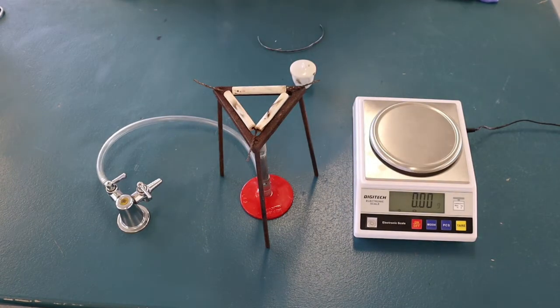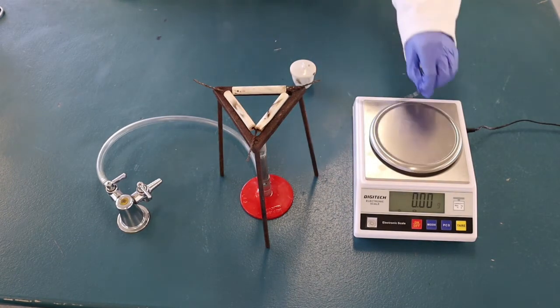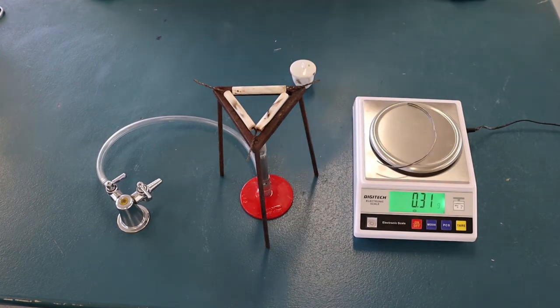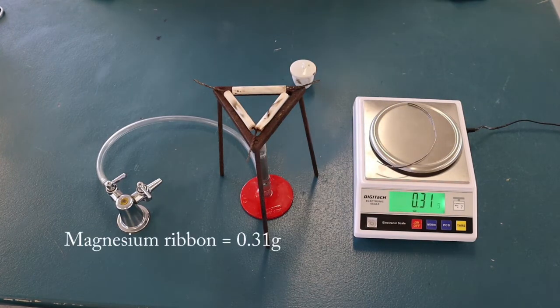Weigh the magnesium ribbon on the electronic balance. The magnesium ribbon weighs 0.31 grams.